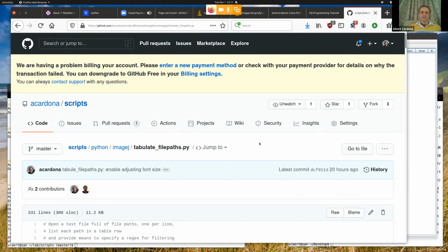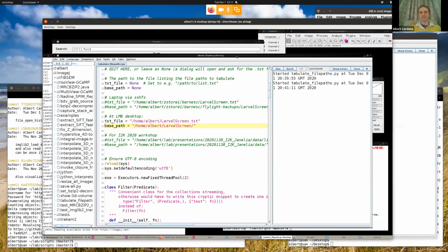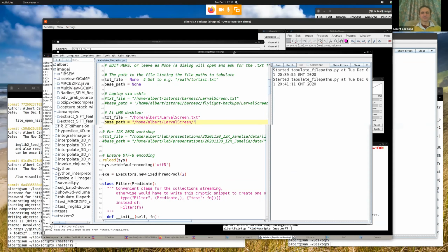But basically, we'll get back to that. It's a good question. So this entire file exists. Okay, never mind. I just wanted to show you that this exists in GitHub. Now it's there in the video, you can see it. And I think that Mark Corrales pasted the link onto the chat.